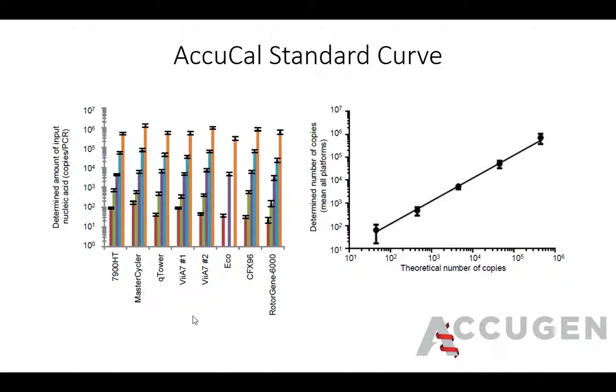At the bottom is labeled as machines. In here, the lambda DNA had produced the expected copy numbers. Averaging those produced a line of best fit that has a fairly nice slope of the averages, as you can see.